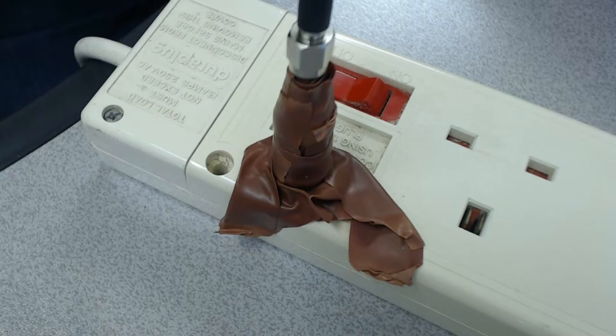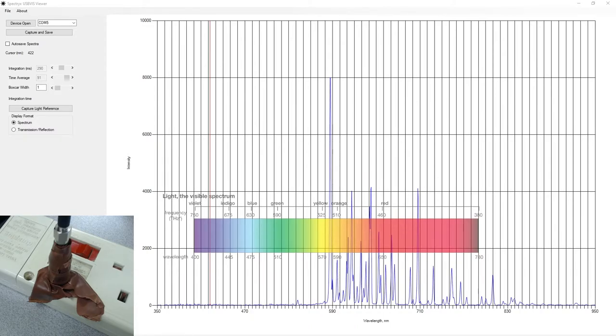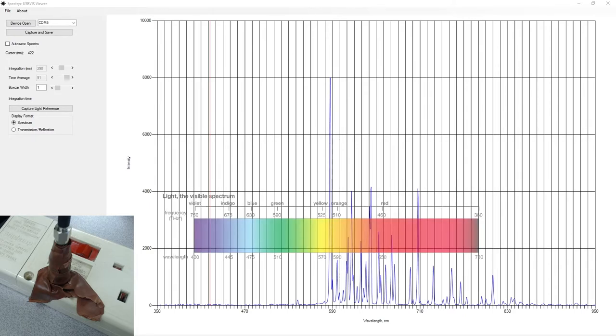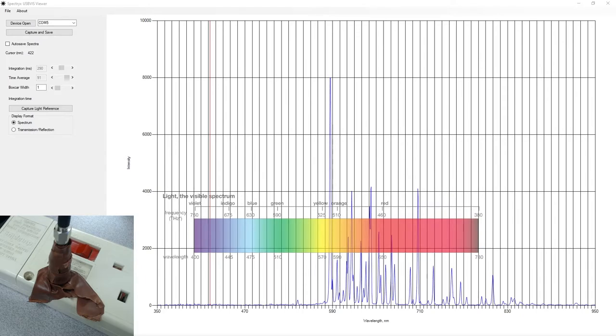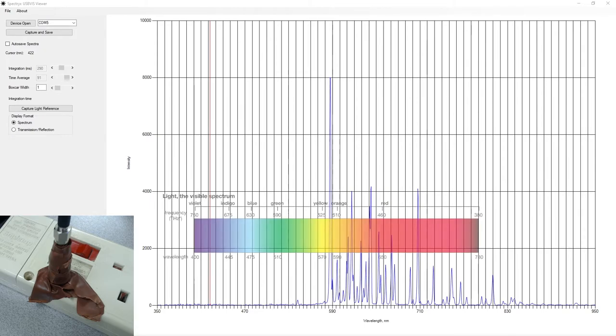If we turn off the overview image here you will see that I have captured a spectrum. In fact it's live, and what you are seeing is the spectrum. I've got the color overlay there which we've used before. The clean image of the spectrum is this one. If I go to here you can see the overlay of the visual spectrum. That overlay is at a transparency level so you can see the lines below. It's actually less saturated but it gives you a good idea.